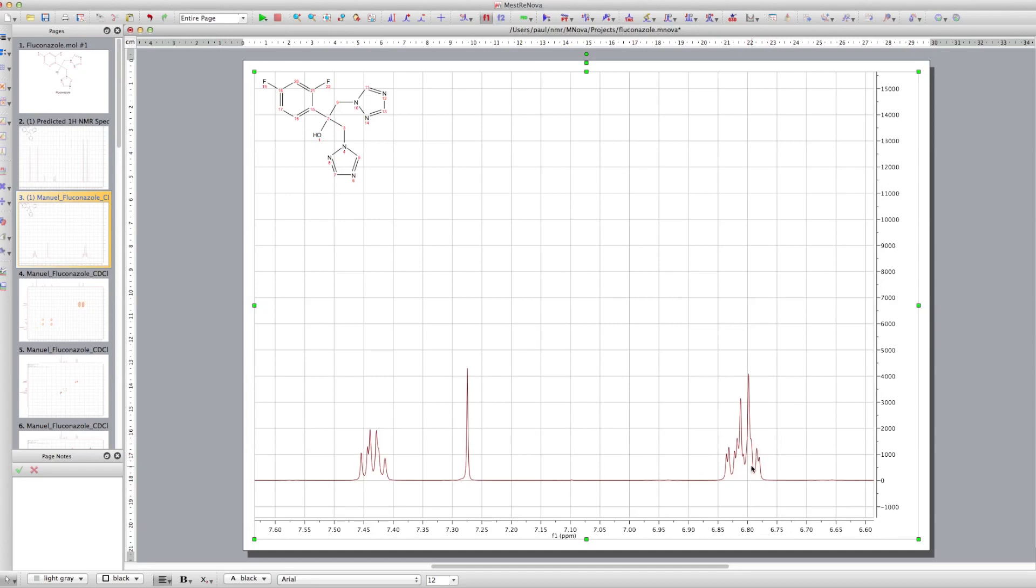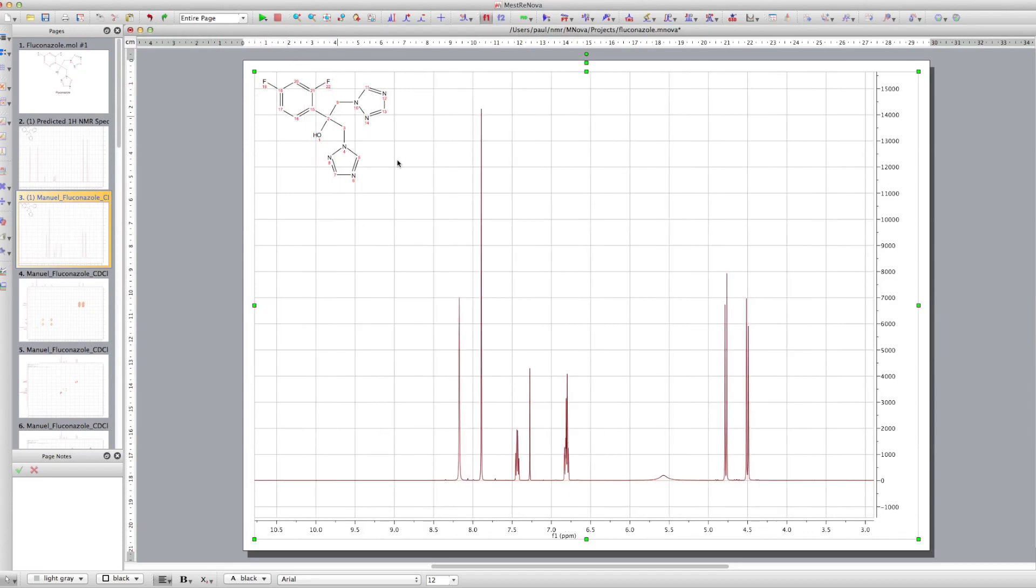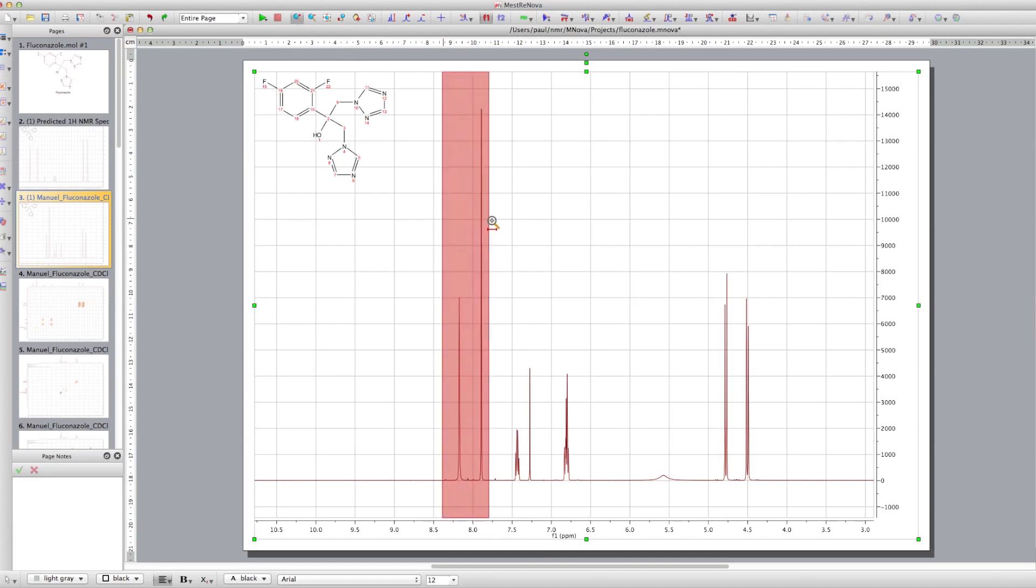And we look at the complex nature of the protons in the aromatic ring as well. They're not as clearly defined as we saw in the predicted patterns. But we've still got the coupling with fluorine. So that really is present.